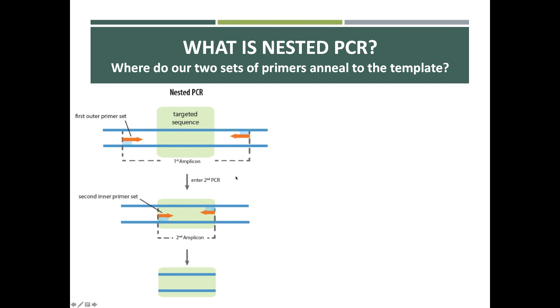So they may bind here, but they might bind other places of the genome. But you do reduce the amount of DNA, right? Because remember, initially you have all of the cell's DNA as a target for the primers to bind to. And so these degenerate primers aren't as specific, so they should amplify your target sequence, but they might also amplify other regions as well.